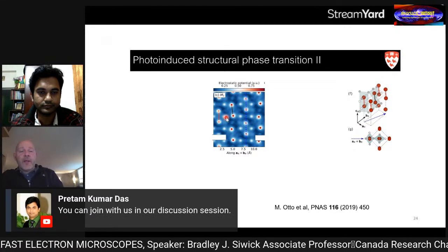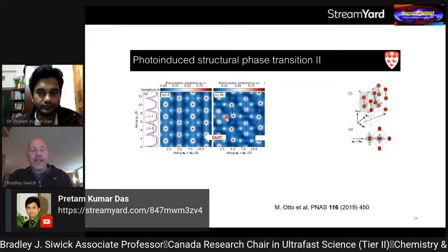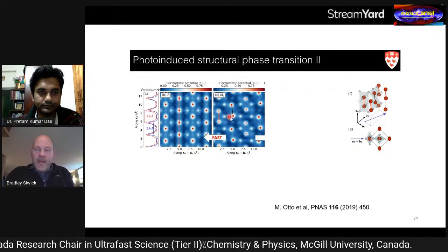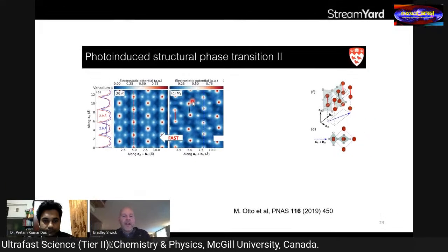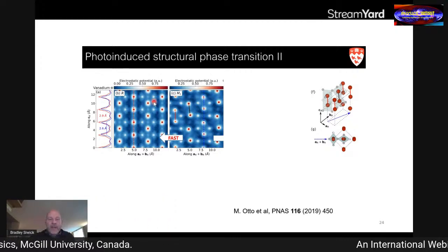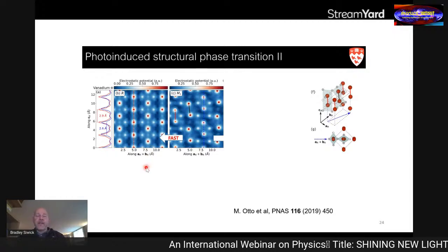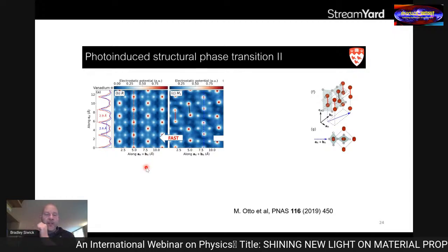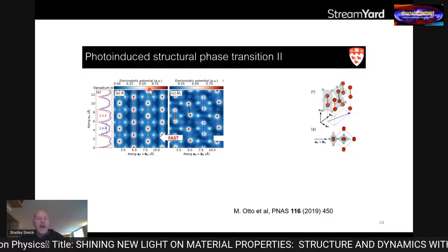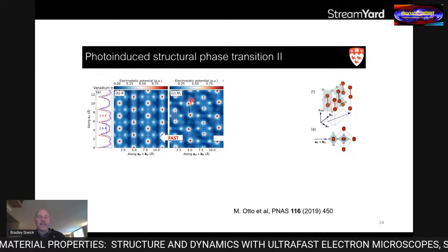So what's the difference between the observed fast process and slow process? Well, the fast process can easily be understood crystallographically. It is to be understood as the laser excitation essentially breaking these vanadium dimer bonds and the atoms moving into the relative arrangement that's to be expected in the rutile structure that I showed you, where you have an equally spaced separation of the atoms along this axis, and you've lost the tilt of these dimers along that same direction.